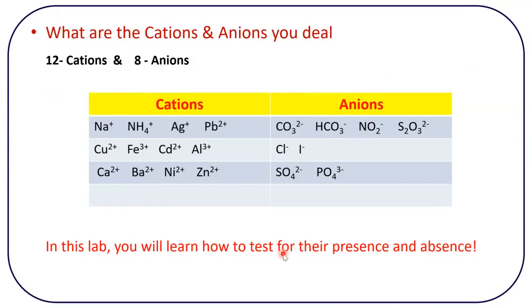In order to identify if you have a mixture of anions, you have to follow a certain scheme. Inshallah, I'm going to explain this scheme in the next meeting. But today I'm going to explain the groups according to the classification of acids. So we're going to classify anions into three groups.